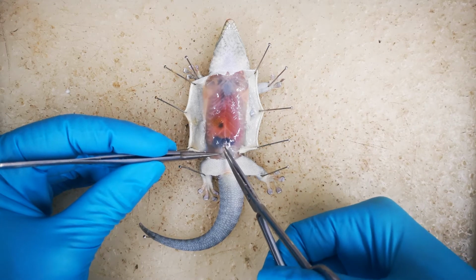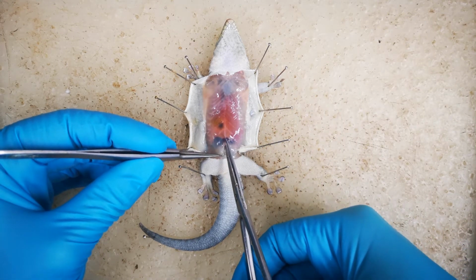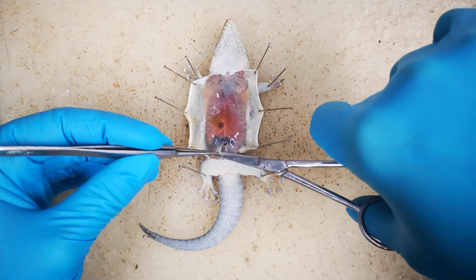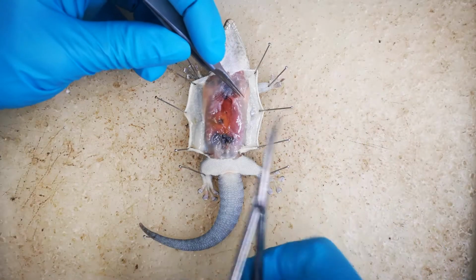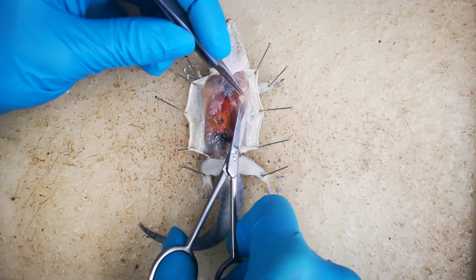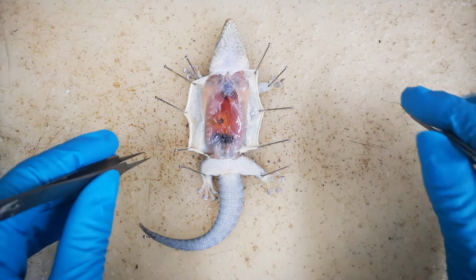To open the body cavity, a small incision is made posteriorly and run anteriorly along the sagittal line. We must cut through the thin, semi-translucent xiphisternal and post-xiphisternal ribs. We can then gently pull open the peritoneum to expose the internal organs.